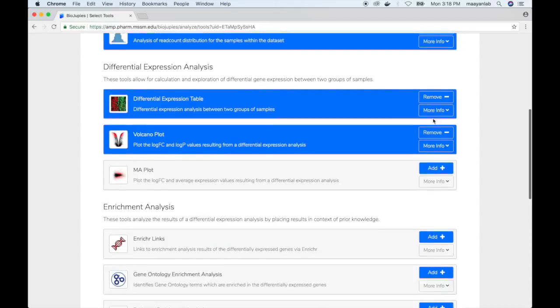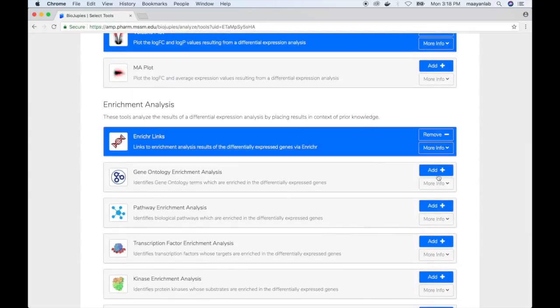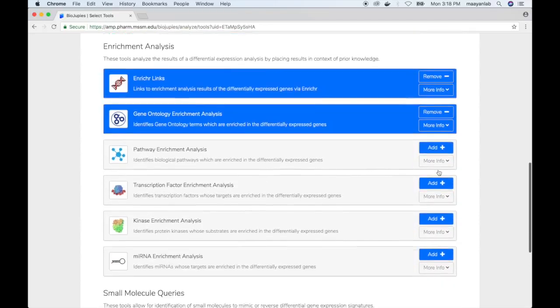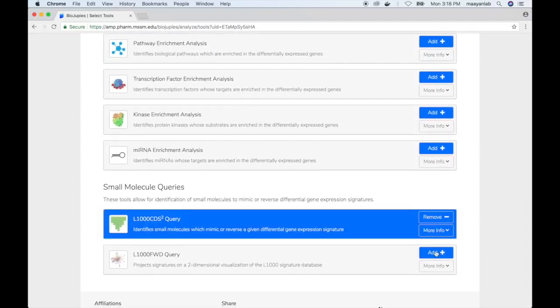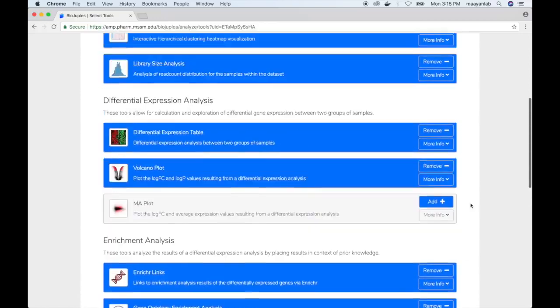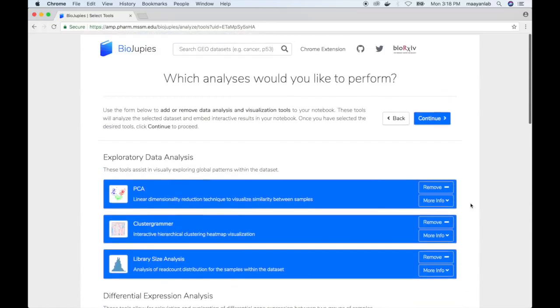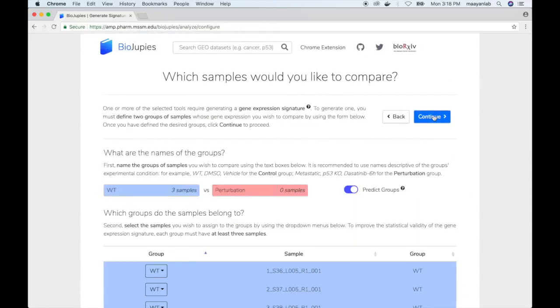We'll select a couple tools from each of the sections and then click on continue to proceed to the next step of notebook generation.